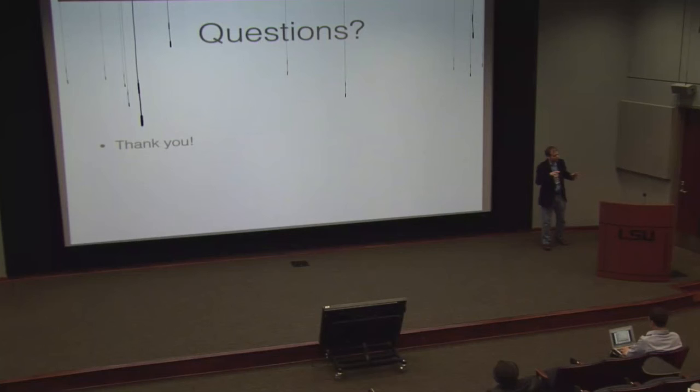That's one of the problems we had, because we tried out BioLinux, but part of the problem with it is all the tools that they put in it are static unless you get a new distribution. So we went the same route, and we installed Ubuntu, put our own tools on it, and used Clonezilla to just put it on different machines. But I wonder if you have any kind of vision as to how to potentially solve that problem. If you're continually distributing this BioUbuntu, do you envision a way of automatically updating the tools in it, or do you have to create a new image every time you want to update tools?